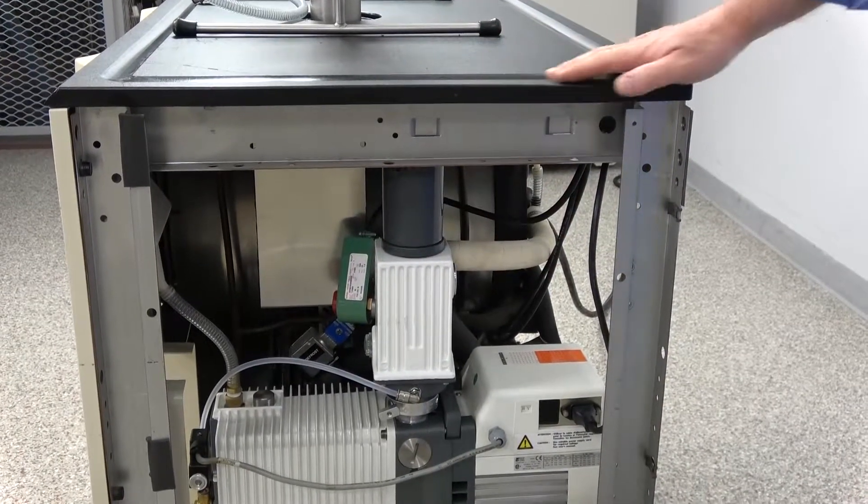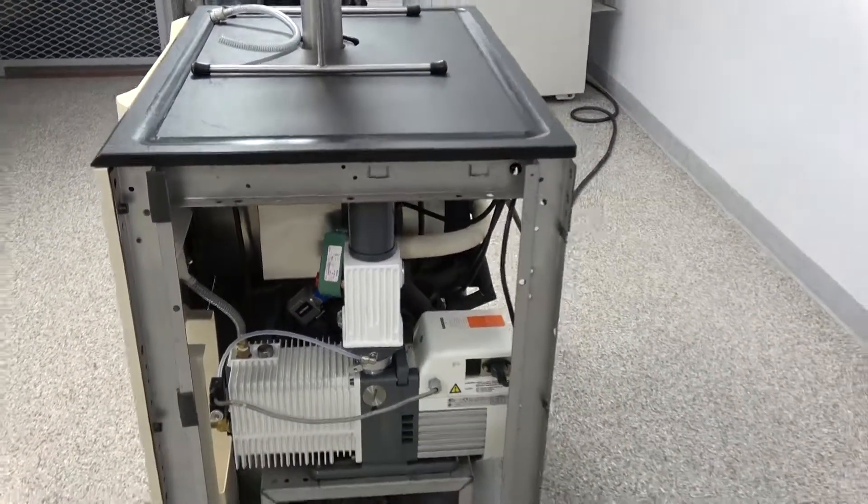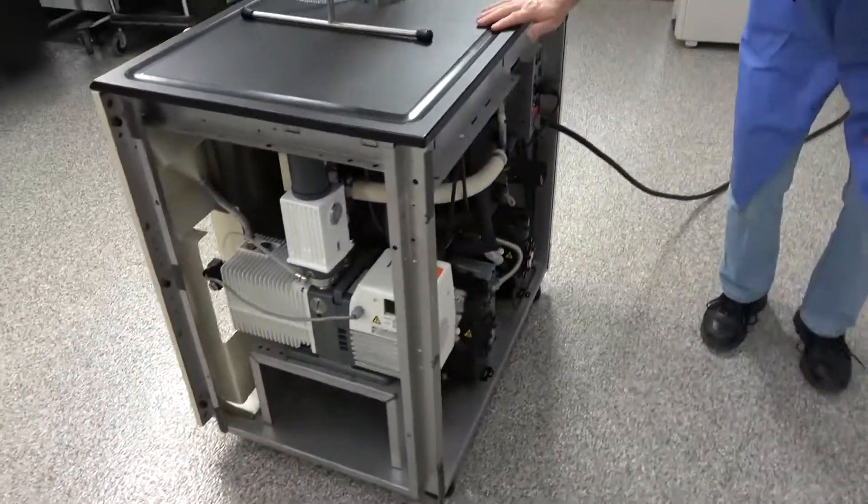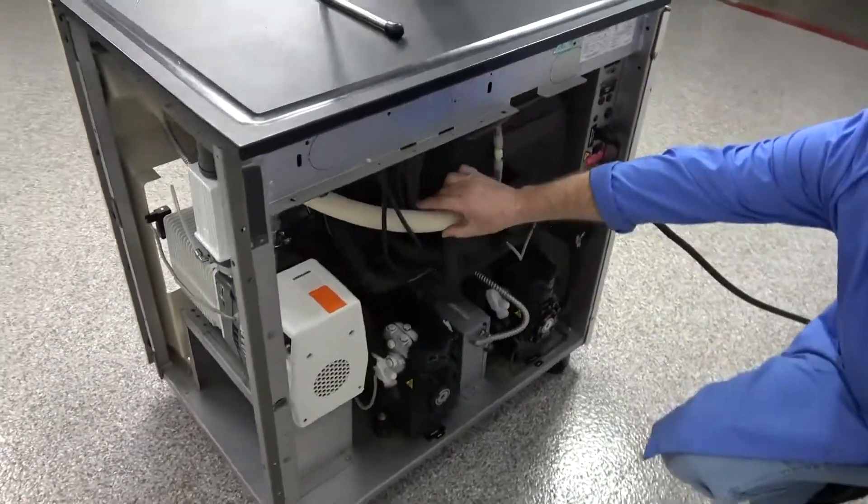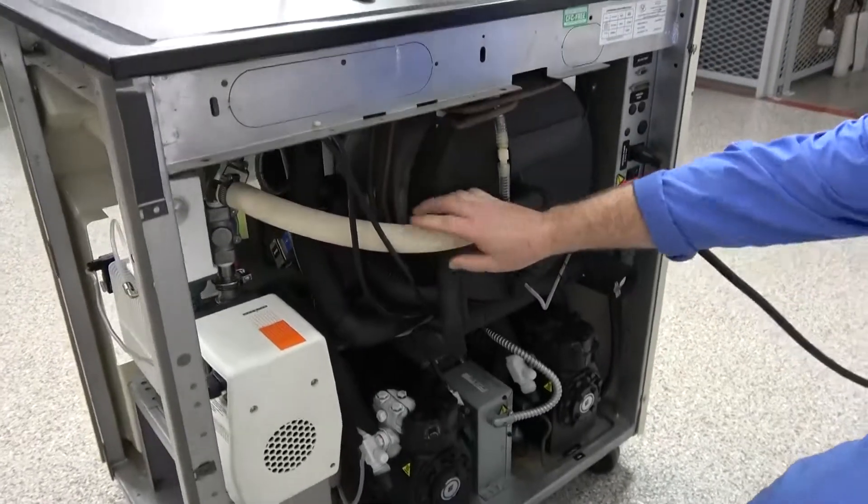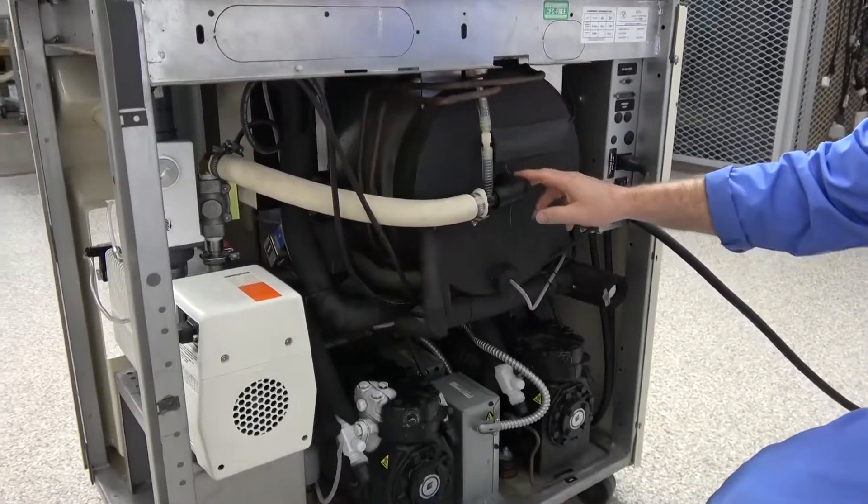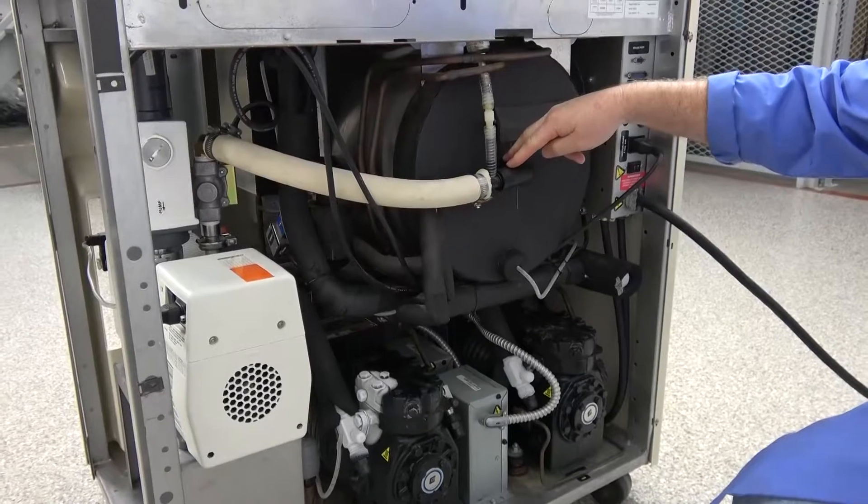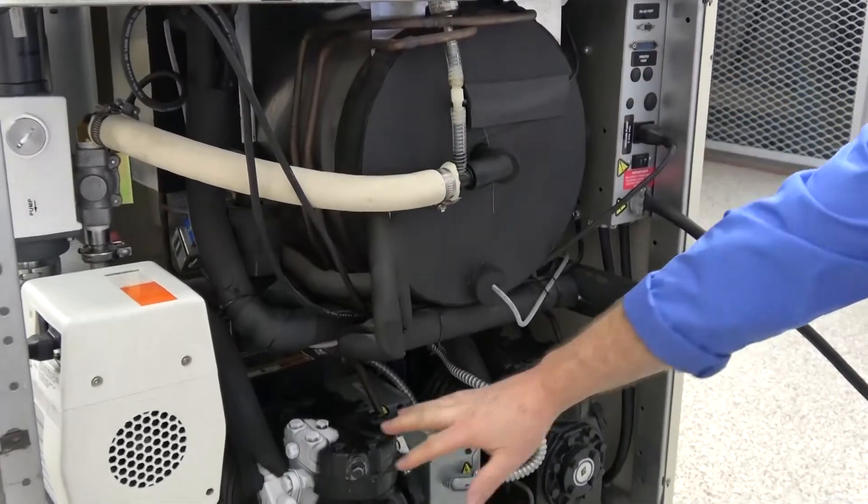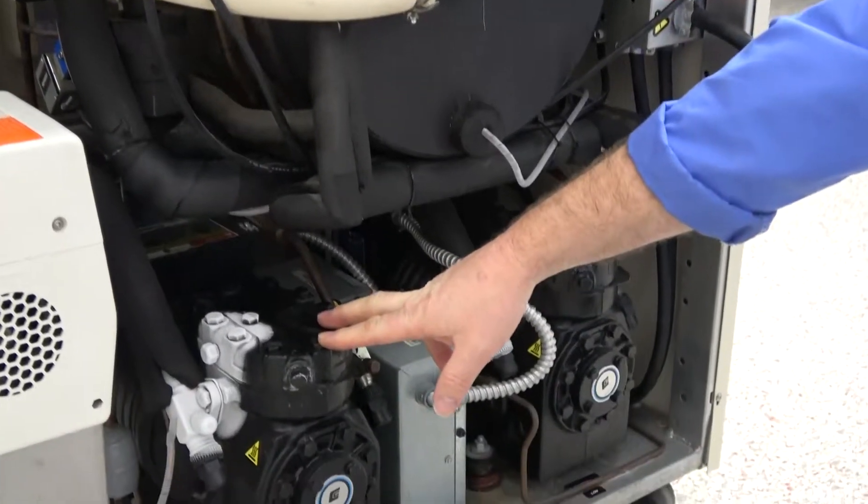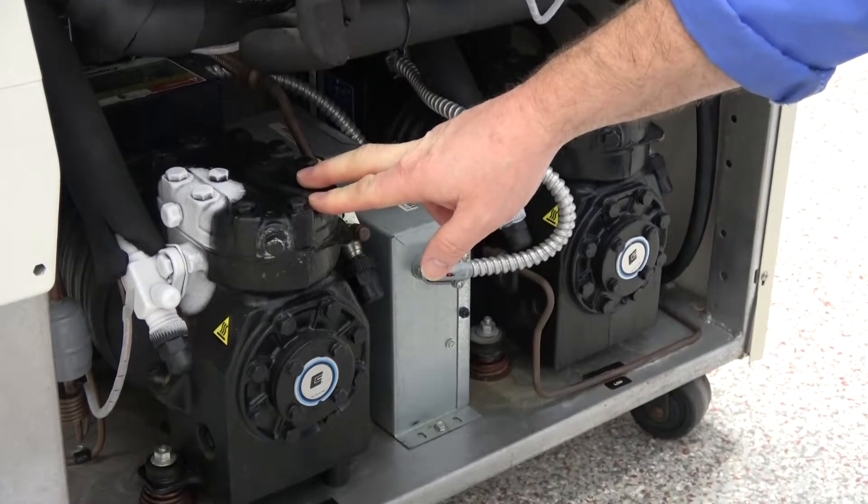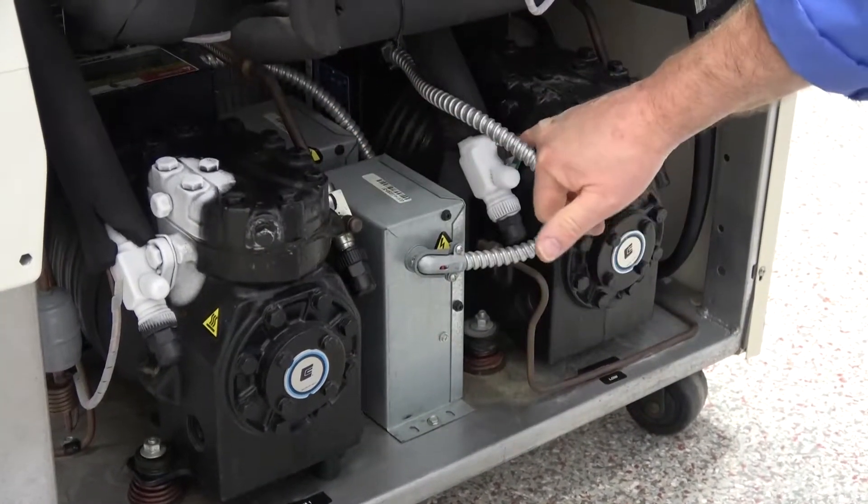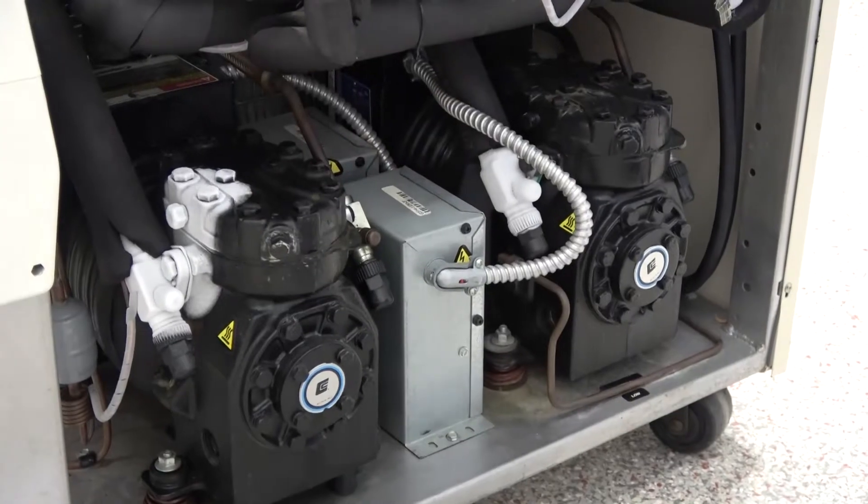And I want to also come around the back just to point out how nice this machine is. Again, we always change out all the vacuum hoses here. You can see we put new vacuum hoses on everywhere to get the best performance that we can. You can see the two compressors down here. They're pretty much maxed out. You can see the frost build up here. Very normal for these.